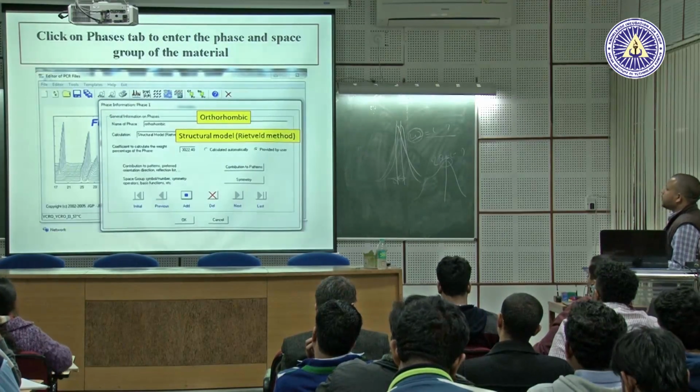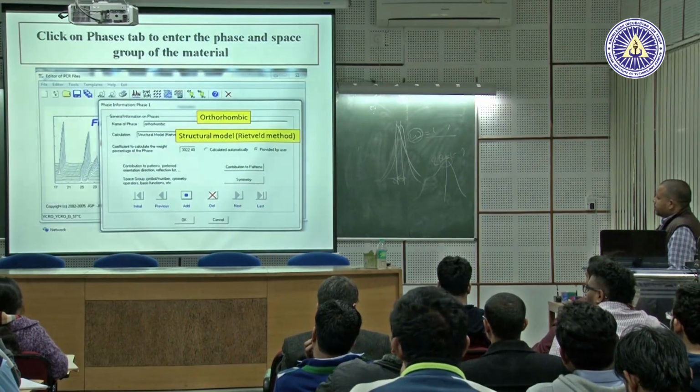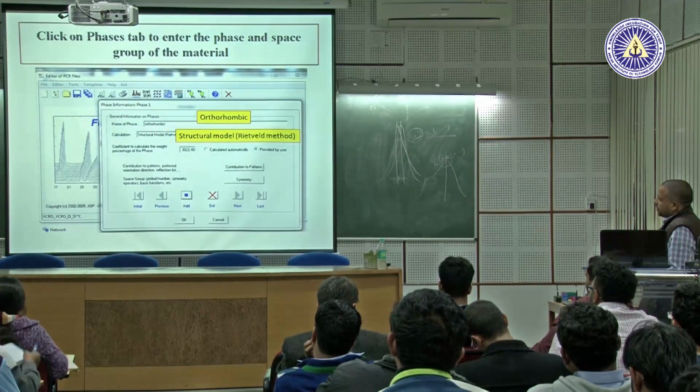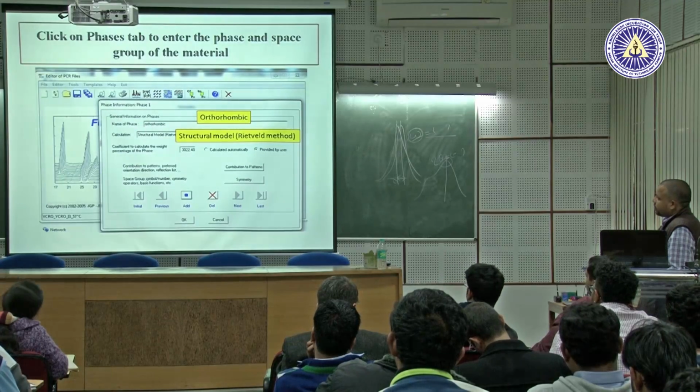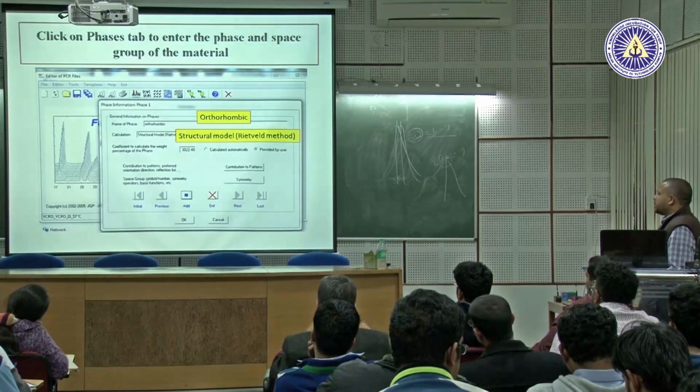Then the phase information. You should write the name of the phase for the sake of your own knowledge.